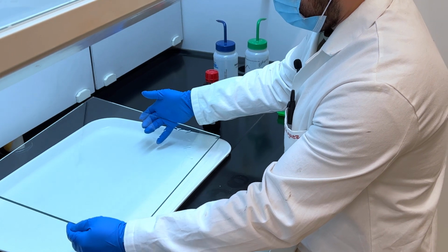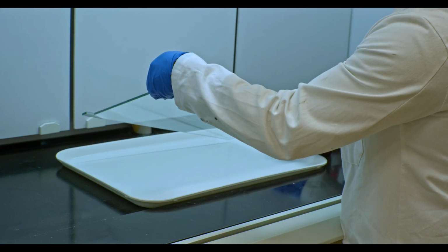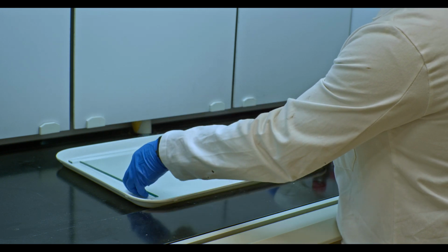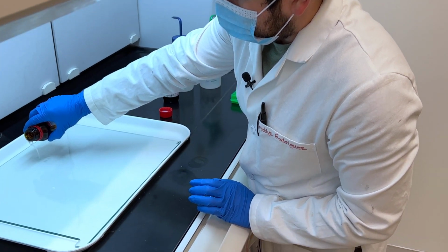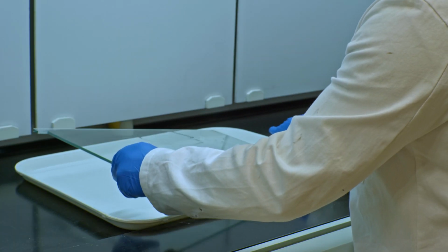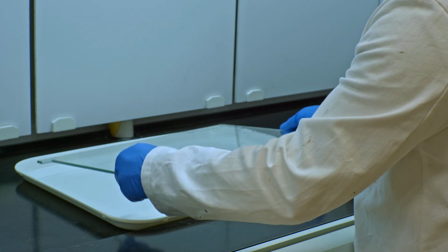If you feel like you need more siliconizing reagent, feel free to use it. According to the manufacturer, you can use any excess siliconizing reagent. You can put it back in the bottle for reuse. I, however, don't do that. I like to just use a little bit of it and call it a day, just to make sure that the next time I use the siliconizing reagent in that bottle, it's actually fresh and not made up of somewhat used siliconizing reagent.